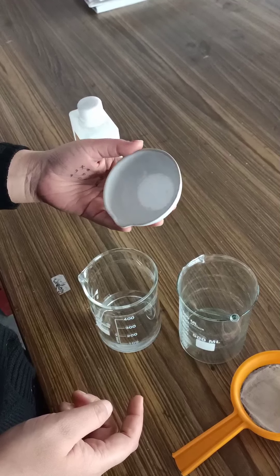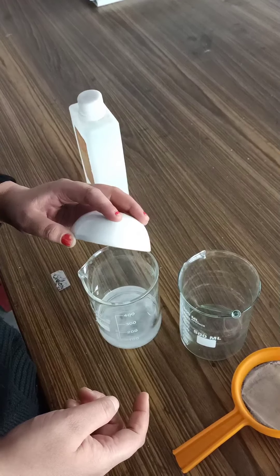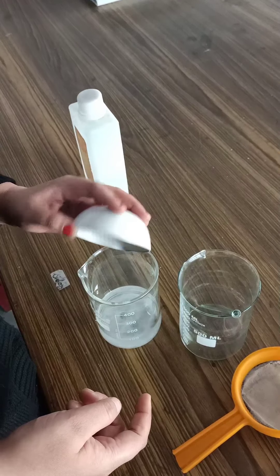Good morning class. We are going to perform an experiment in bio lab. The aim of the experiment is to extract DNA from ripe banana.